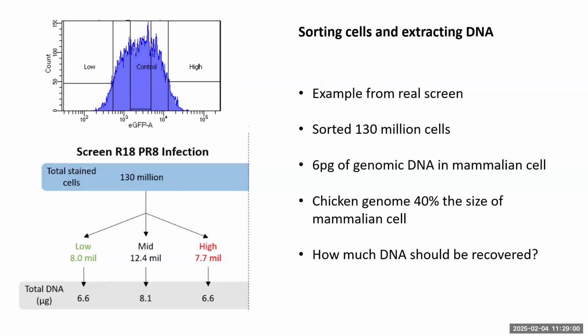Yeah, and so that kind of sounds quite low, but what you've got to remember is these have now been sorted into populations. This is like 5% of the entire coverage of the library you now have in that. So you don't expect to have 300-fold coverage. You expect to have less than that. I guess if you actually divide the 37 by 5%, it actually gives you quite high coverage, like 600-fold or something like that. So this is looking like quite a well-powered experiment.